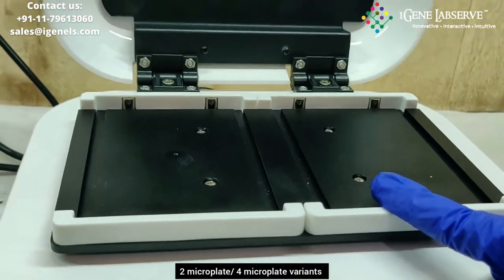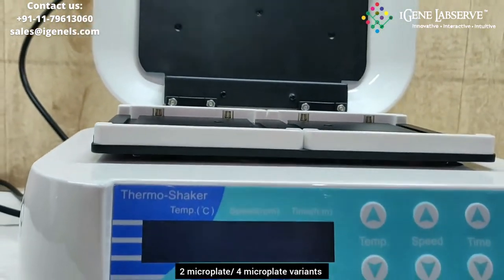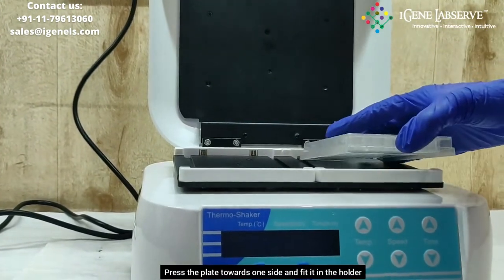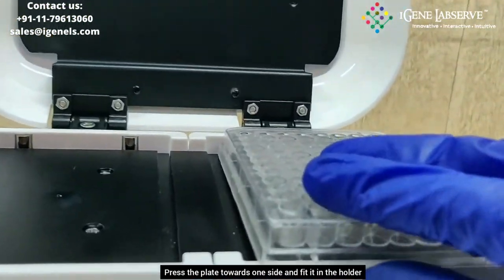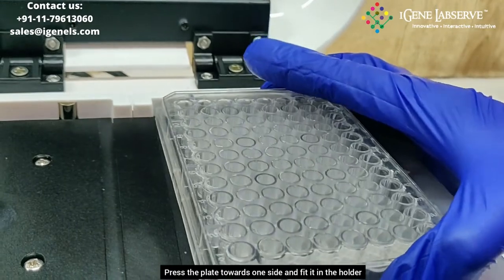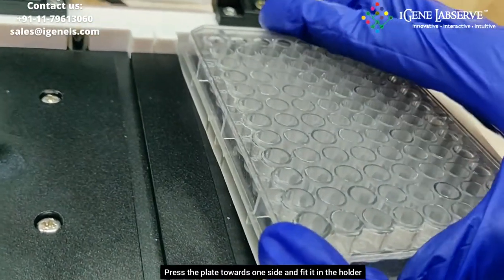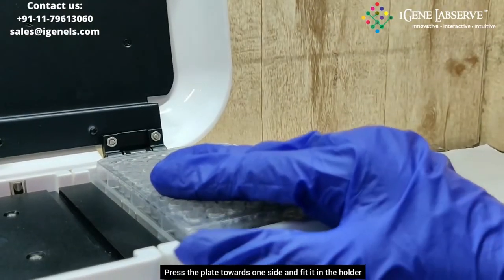There is another variant with 4 plate holders. To keep the plate over here, you have to place the plate by pushing it towards one side and it fits inside it like this.